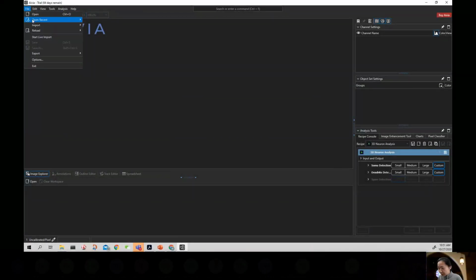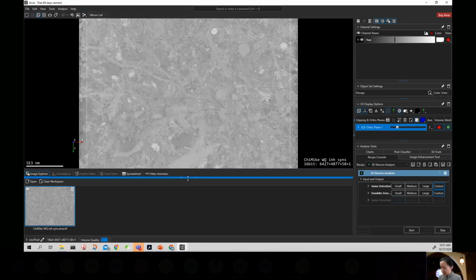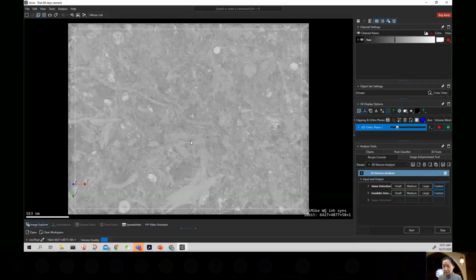Hi, Wan-Qing. I'll read you the question since you're busy setting this up. One question from Shasha here. She's asking, how many samples did you use to train the pixel classifier for the EM image, and were you able to use different types of models for the training?